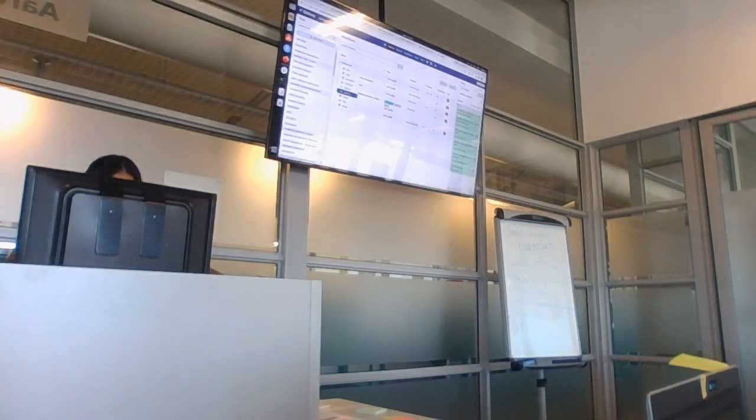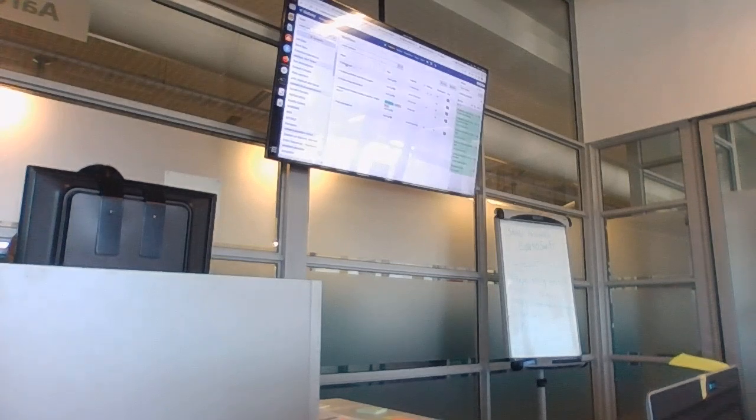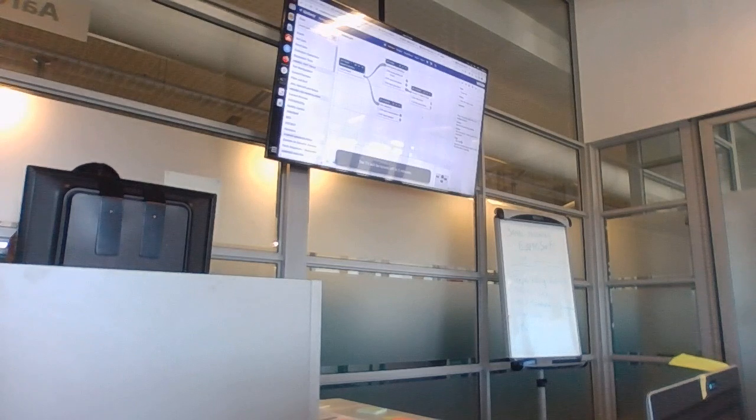What is the issue now? That image you showed earlier, the one that shows the SVG, the way the workflow is looking. Oh, you say you prefer this view? Yes, but then when I export it.